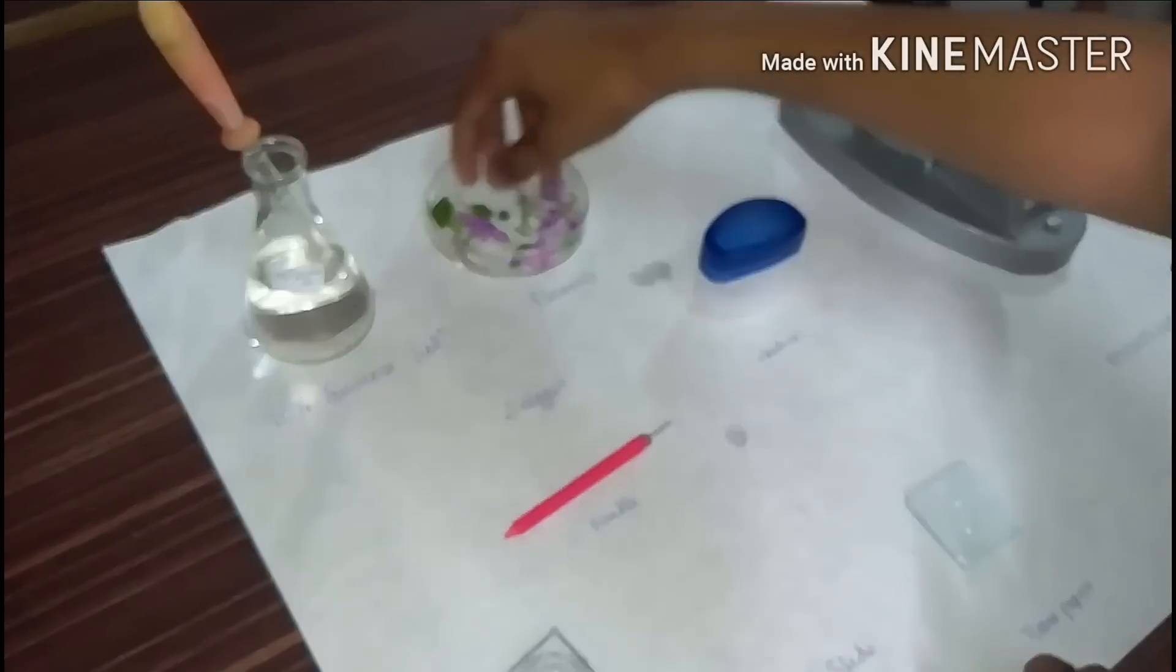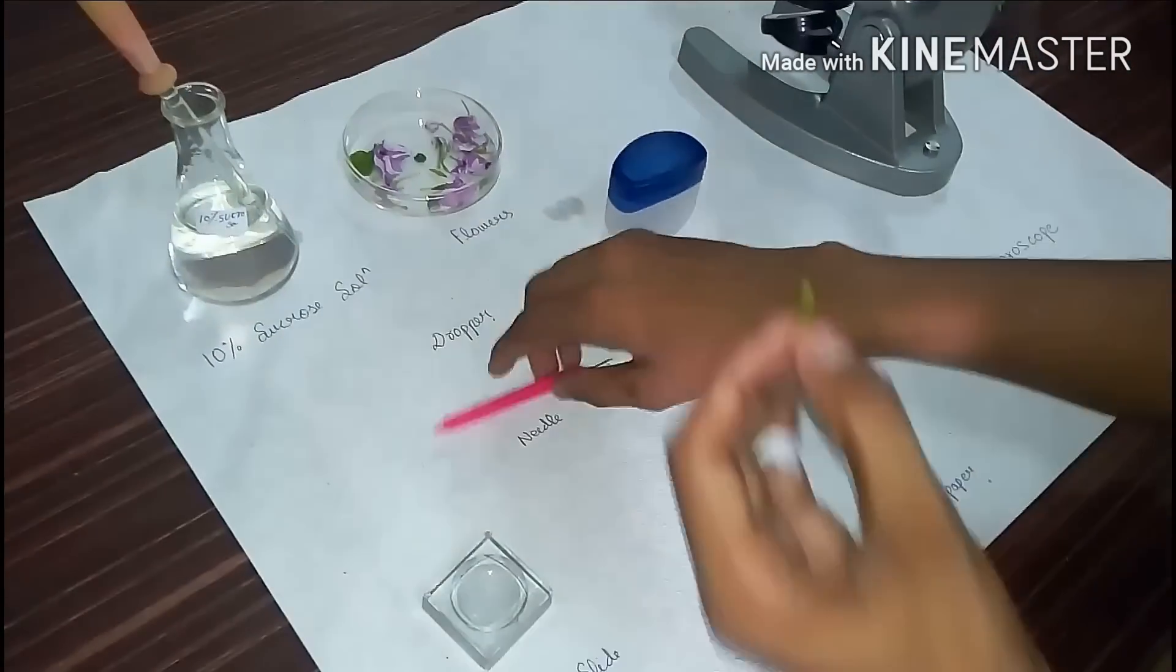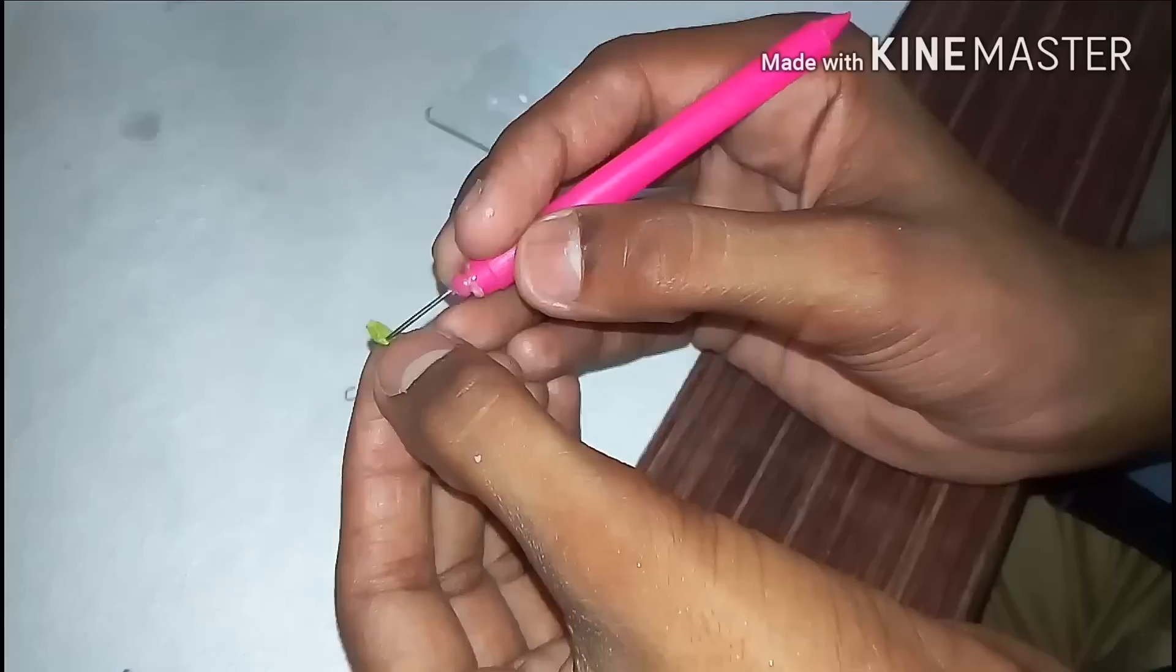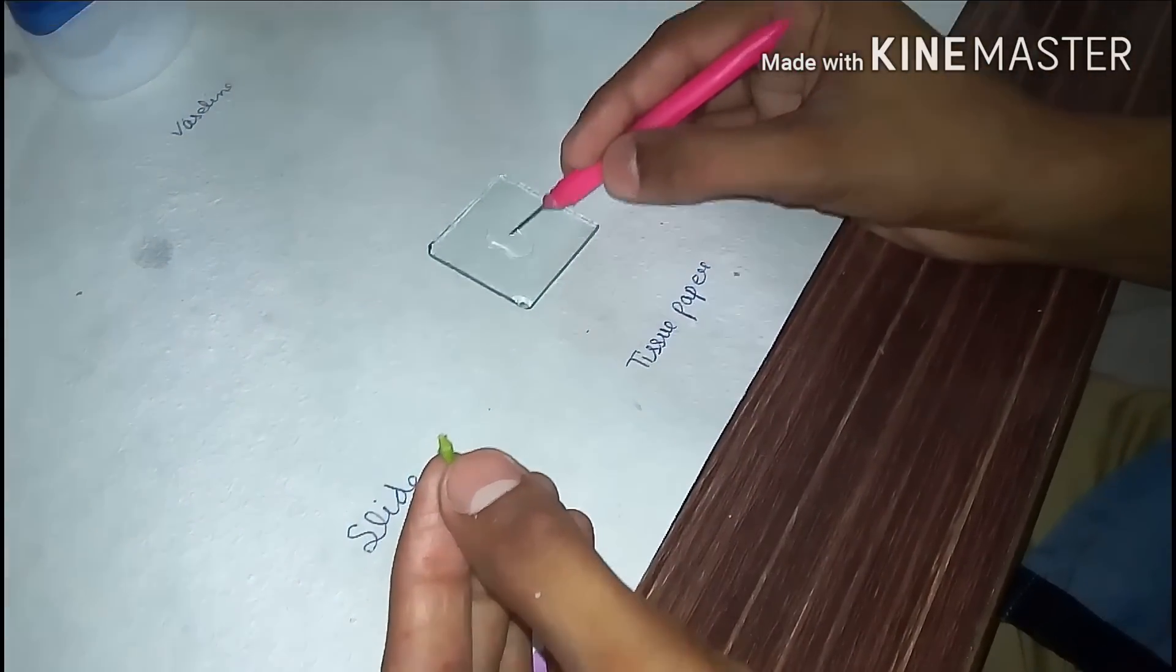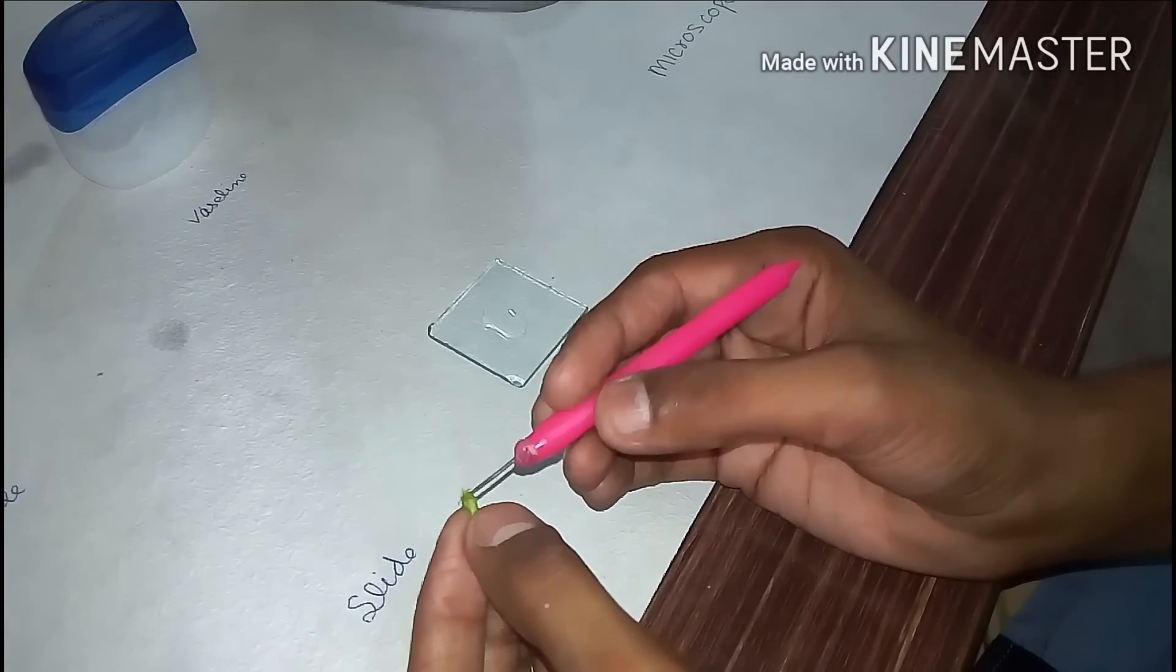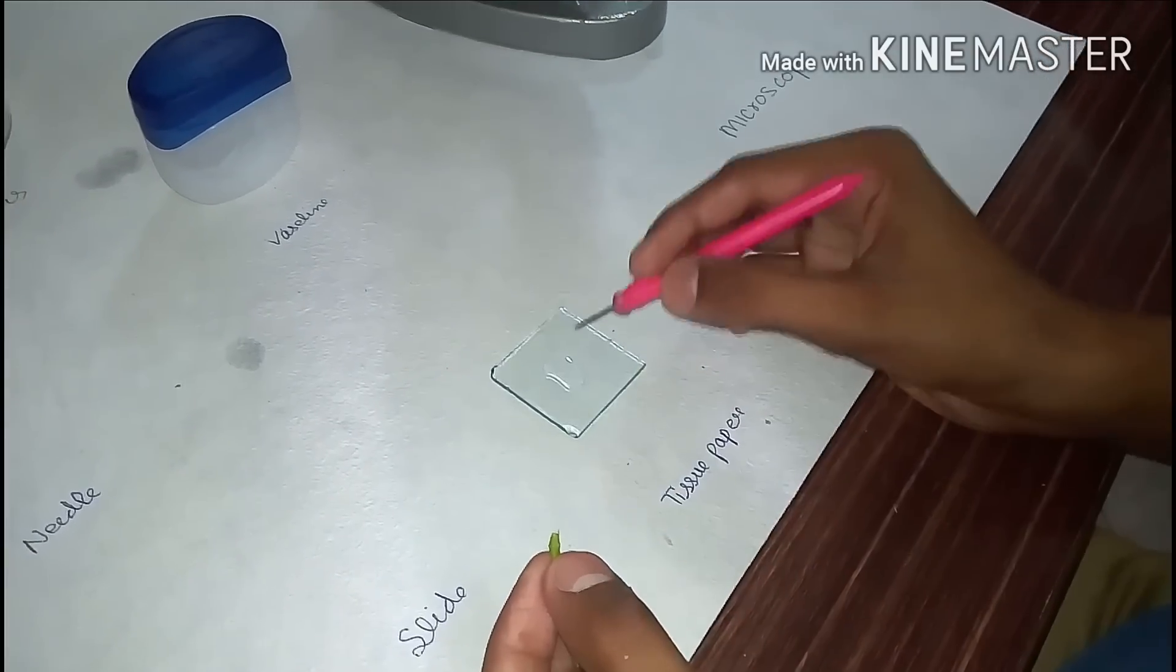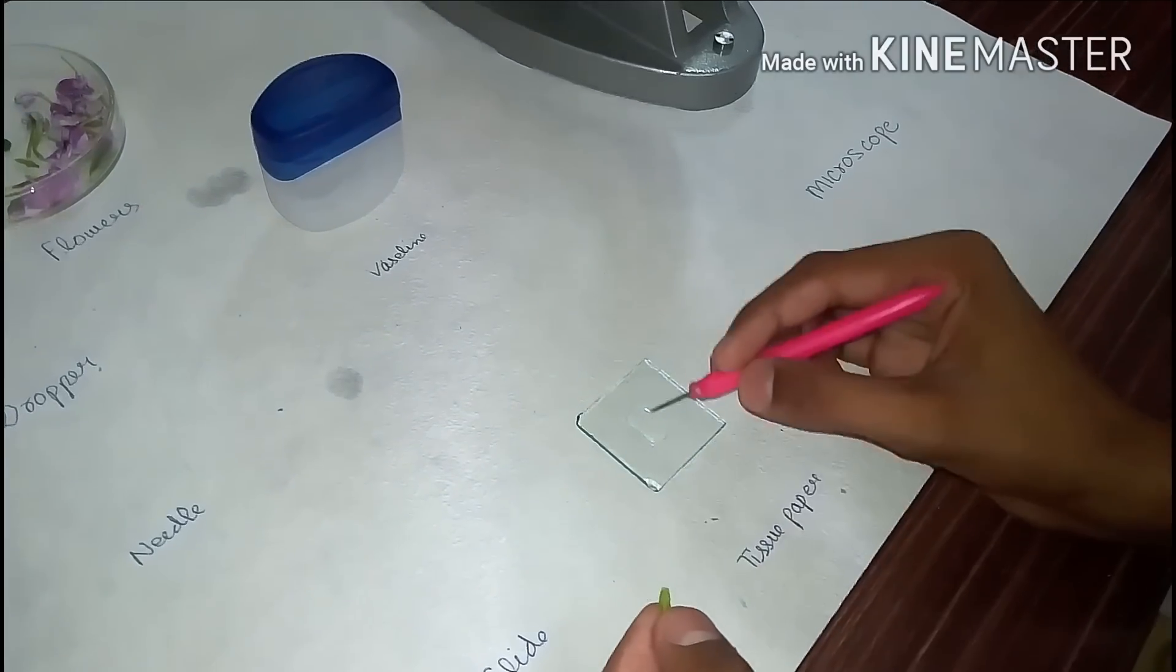Now take a flower for the pollen grains. This is a Sada Bahar flower and first we are going to mark here with a needle and just swirl it around, swirl it around and make it in the drop so that we can have pollen grains. This will surely make only pollen grains, not the whole flower body. After five to six swirls, maybe we can get these pollen grains.